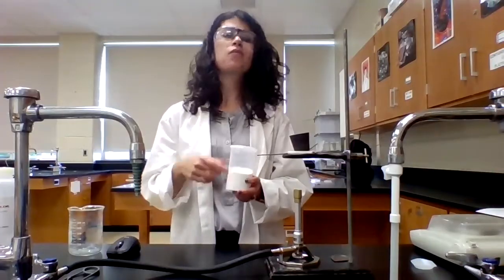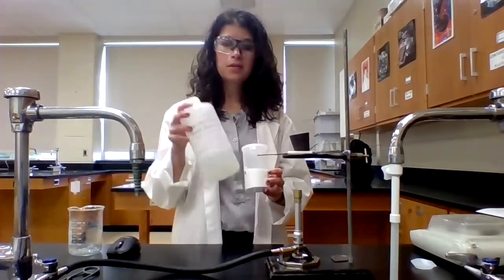So for this lab, what we're going to be doing is determining the identity of a group 1 carbonate. We know it's group 1, but we don't know, is it lithium carbonate, sodium carbonate, or potassium carbonate? So what we're going to do is react our group 1 carbonate with a solution of calcium chloride. That will cause a precipitate to form.